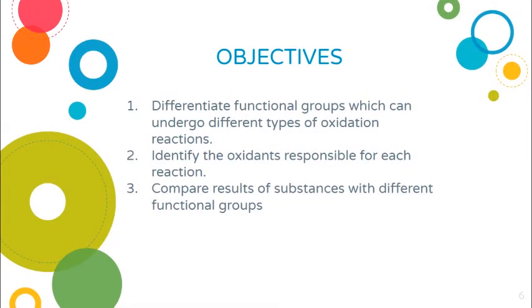For the objectives, the experiment aims to differentiate functional groups which can undergo different types of oxidation reactions. It also aims to identify the oxidants responsible for each reaction. Lastly, the experiment aims to compare results of substances with different functional groups.